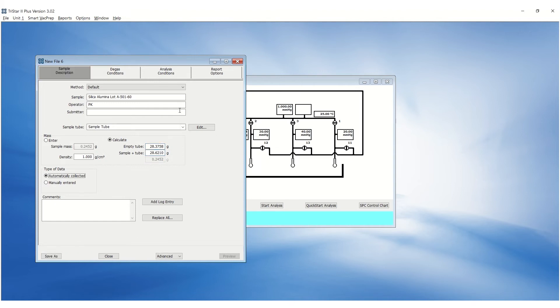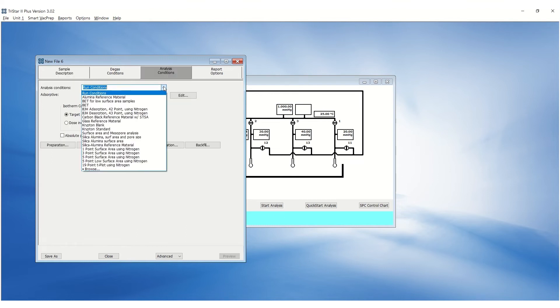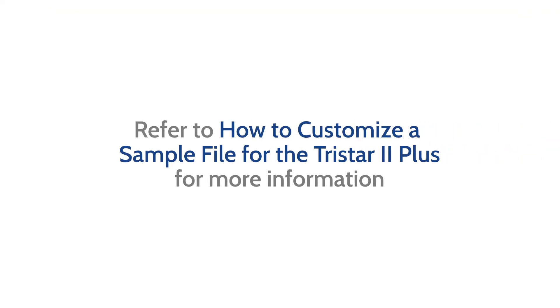Under Analysis Conditions, click on the drop-down menu and select Silica Alumina Reference Material. This will load pre-saved analysis conditions to collect a full adsorption and desorption isotherm. Please refer to How to Customize a Sample File on TriStar 2 Plus Video for more information.